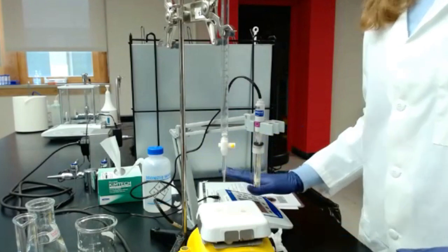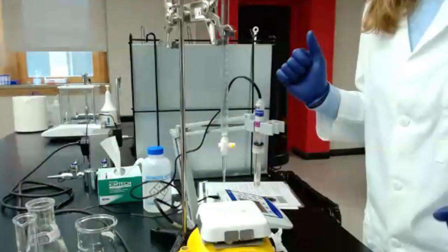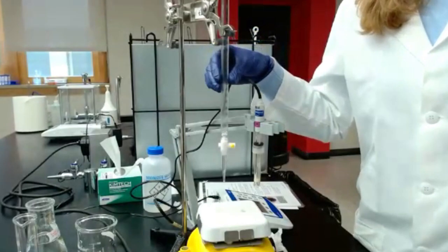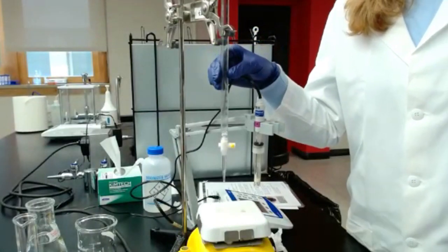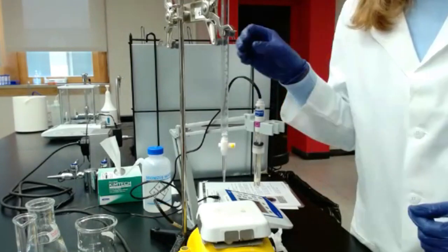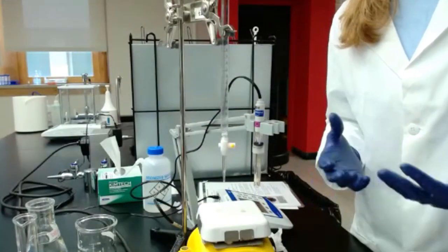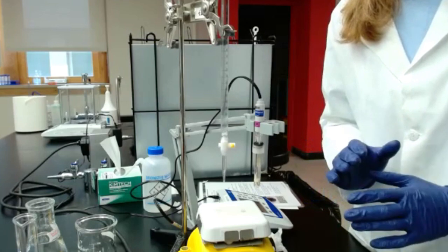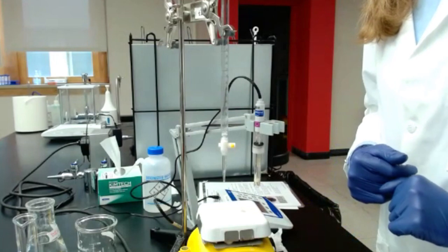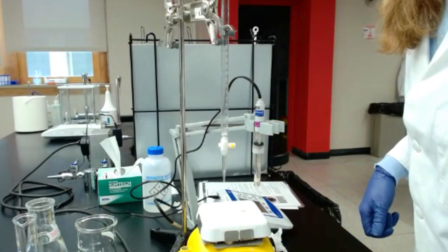So now that the pH meter has been calibrated, we're going to start preparing for titratable acidity. So what we need is first to fill in the burette with sodium hydroxide. And if you use pellets, you might need to develop that sodium hydroxide solution, because we need a liquid. And to do so, you will have to make sure that it's standardized, so the strength of sodium hydroxide is correct. There is a procedure to standardize sodium hydroxide in the handout we sent you. So make sure you go through that step.